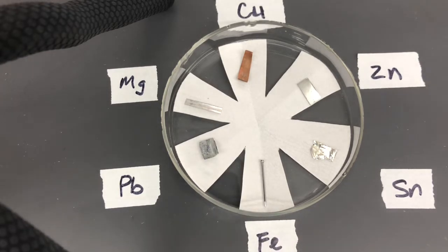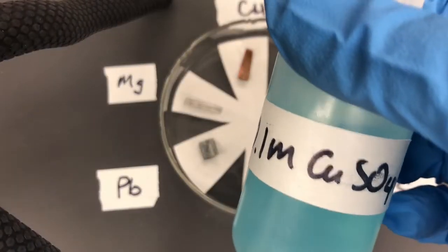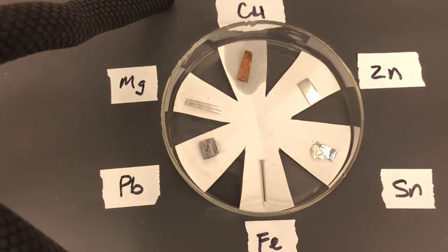What I'm going to do now is I'm going to add to each of those metals a couple of drops of their respective cation solutions. So I'm going to start with 0.1 molar copper 2+, and I'm just going to add a couple of drops of copper 2+ on top of the metal in that section of filter paper.